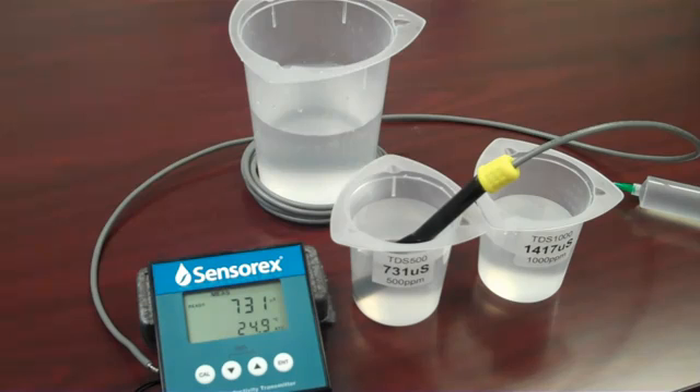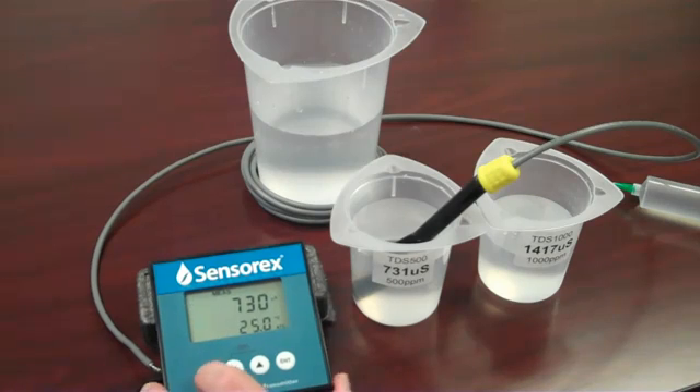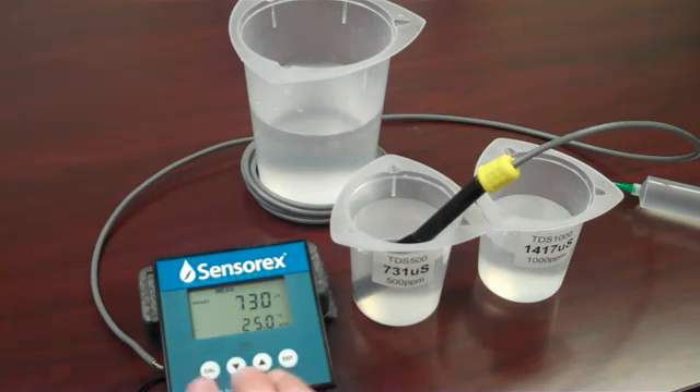To perform the conductivity calibration, press the calibration key to enter calibration mode. The display will flash for a moment until it stabilizes. Use the arrow up and down keys if necessary to confirm the calibration value, then return to measurement mode.